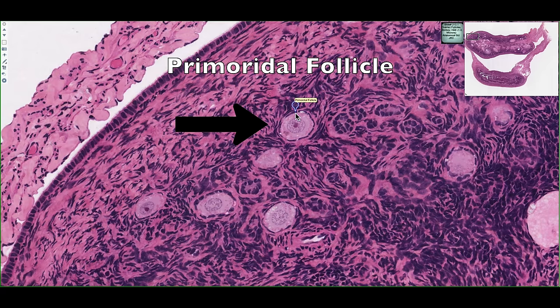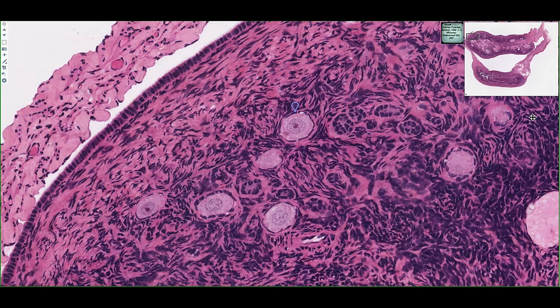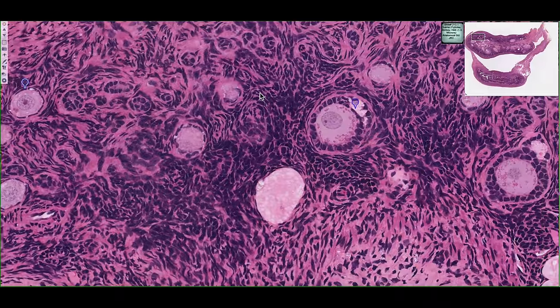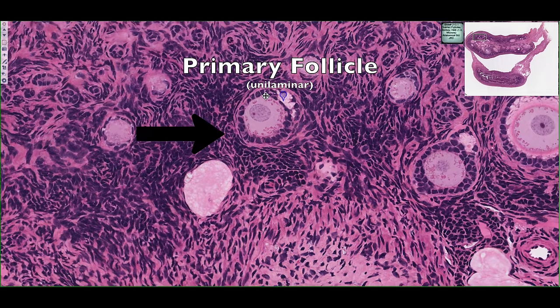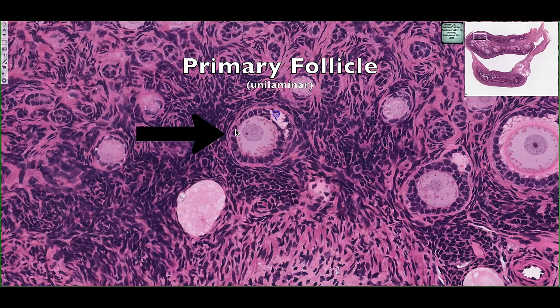The primordial follicle consists of a single layer of flattened cells, also known as follicular cells, and they surround the oocyte. Here we can see the cytoplasm, the nucleus, and the nucleolus of the oocyte. As the primordial follicle begins to develop, the layer of follicular cells surrounding it is going to increase in size. We can see this is a primary follicle, and the follicular cells surrounding it are now more cuboidal in shape, but we can still see the cytoplasm, the nucleus, and the nucleolus of the oocyte.